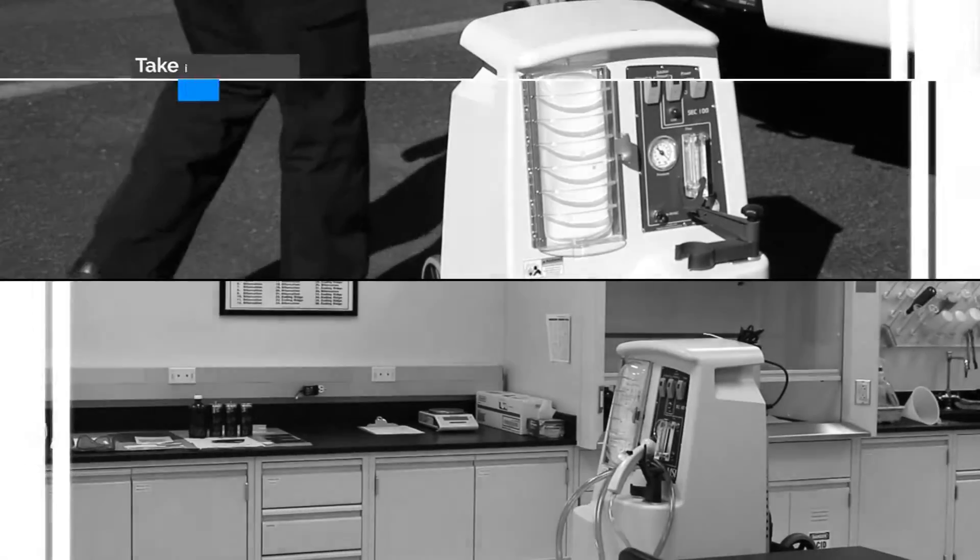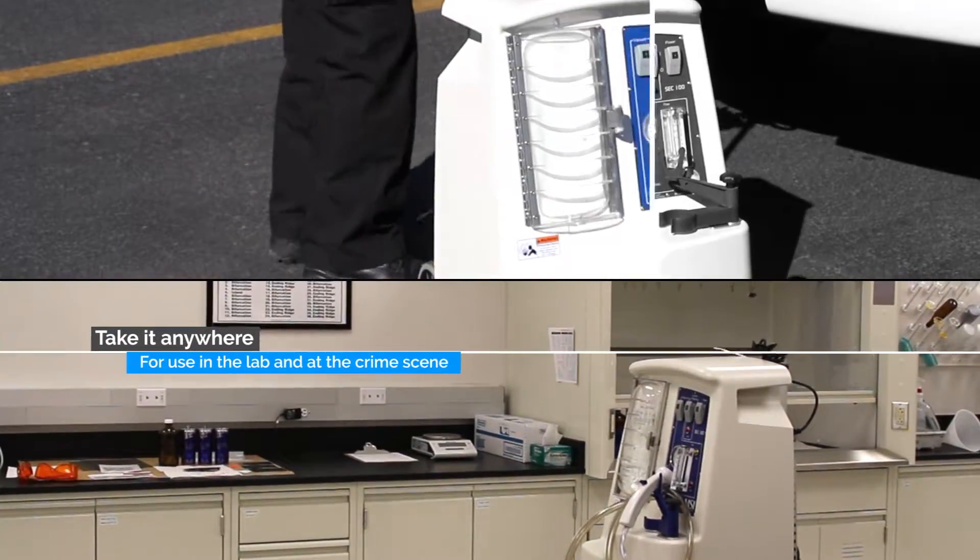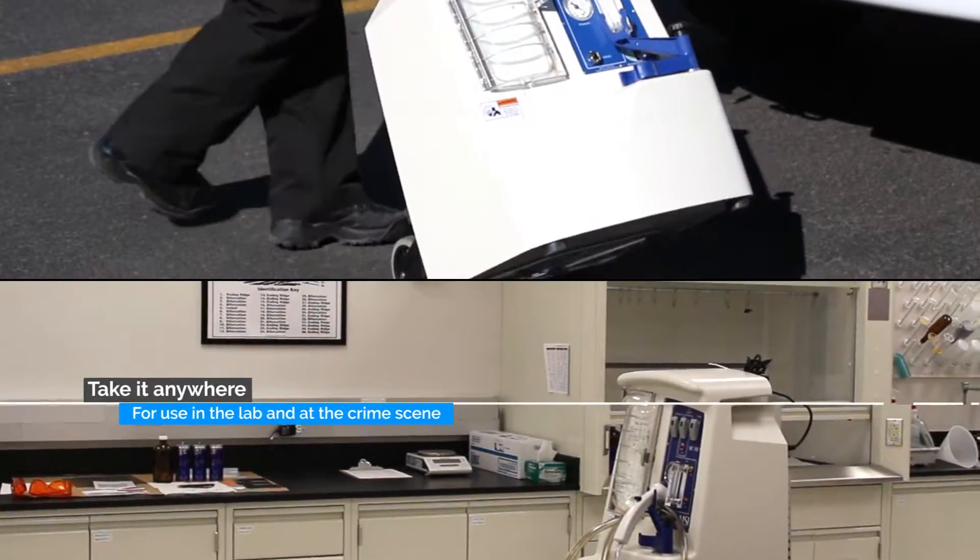Most importantly, it can deliver the best possible DNA sample, either from the crime scene, in a station, or in a lab setting.